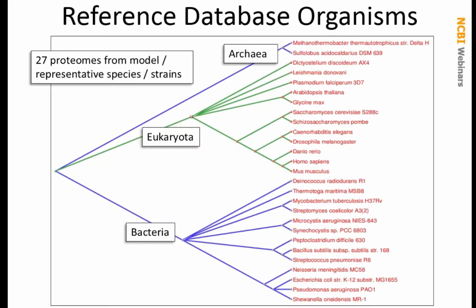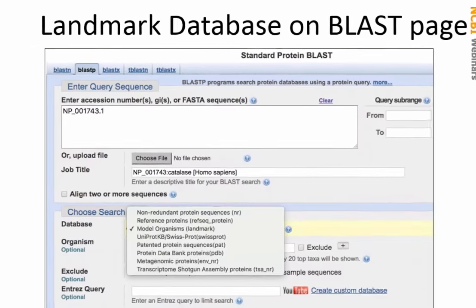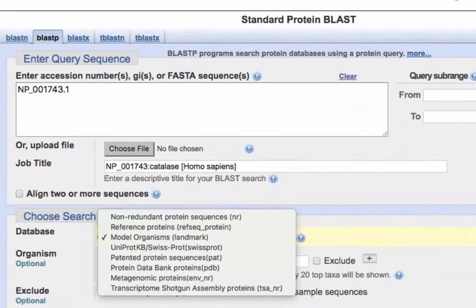This is a phylogenetic tree that Tom Madden made showing the broad phylogenetic spread of organisms represented in this database — a much more balanced view than you'd get searching NR. We have species of bacteria, eukaryotes, and some archaea. This database is available right on the ordinary Protein BLAST page or the translating BLASTX service. You can pick all organisms or the Landmark Model Organisms database. The query we're going to use today is human catalase.